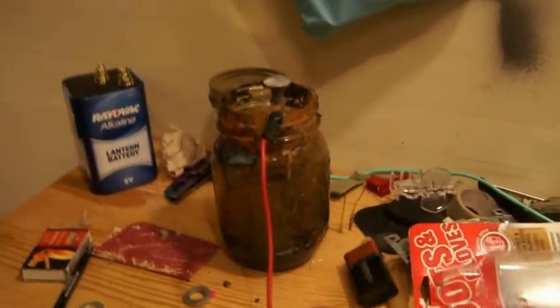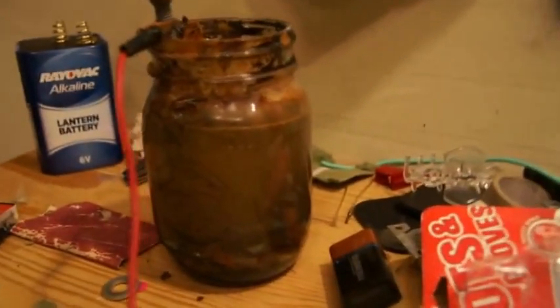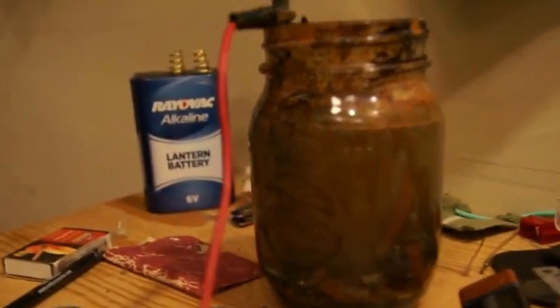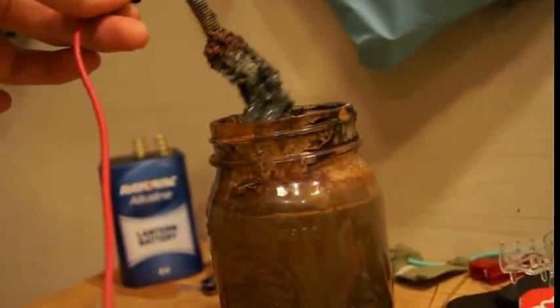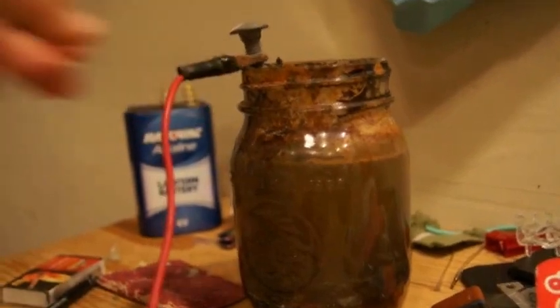Hey guys, we're back. It's been about a day since I started the iron oxide process and as you can see the liquid inside this jar has turned brown. There's a lot of sediment in the bottom of the jar and that's actually our iron oxide. If you look at the nail or bolt or whatever you used, it's actually coated in this stuff — don't worry, it will just come off.